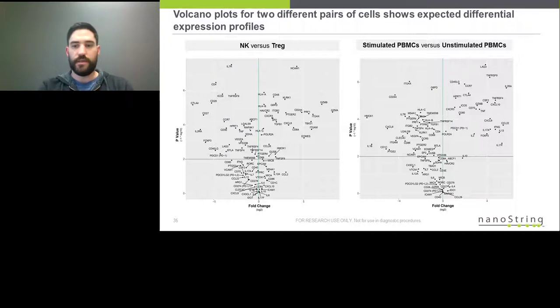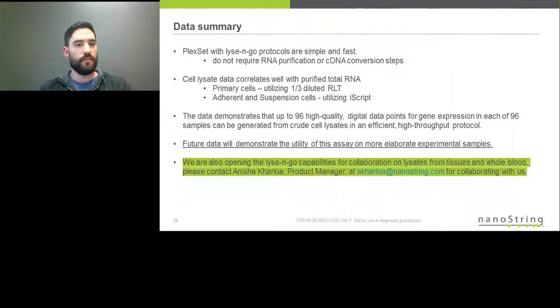P-value shown here, I drew a line at 2, so that's a P-value, and it's a -1 log base 10 scale. So it ends up being a 2 is a 0.01 P-value. So highly significant, see gene shift left and right for there. So again, I encourage you to look a little bit closer at that data when you grab this PDF.